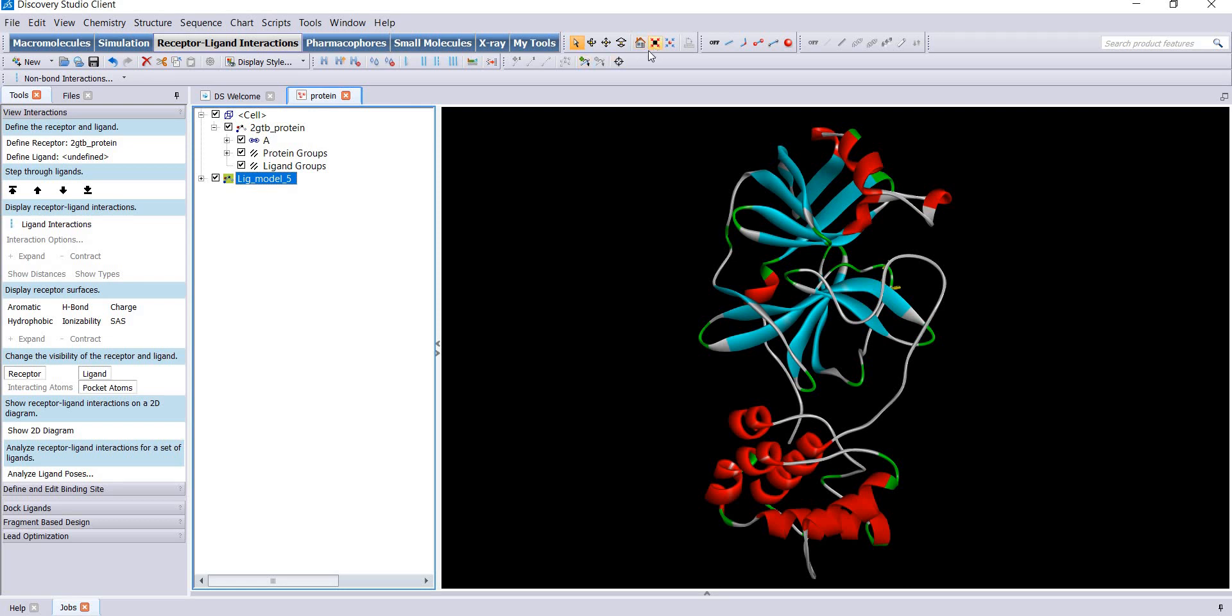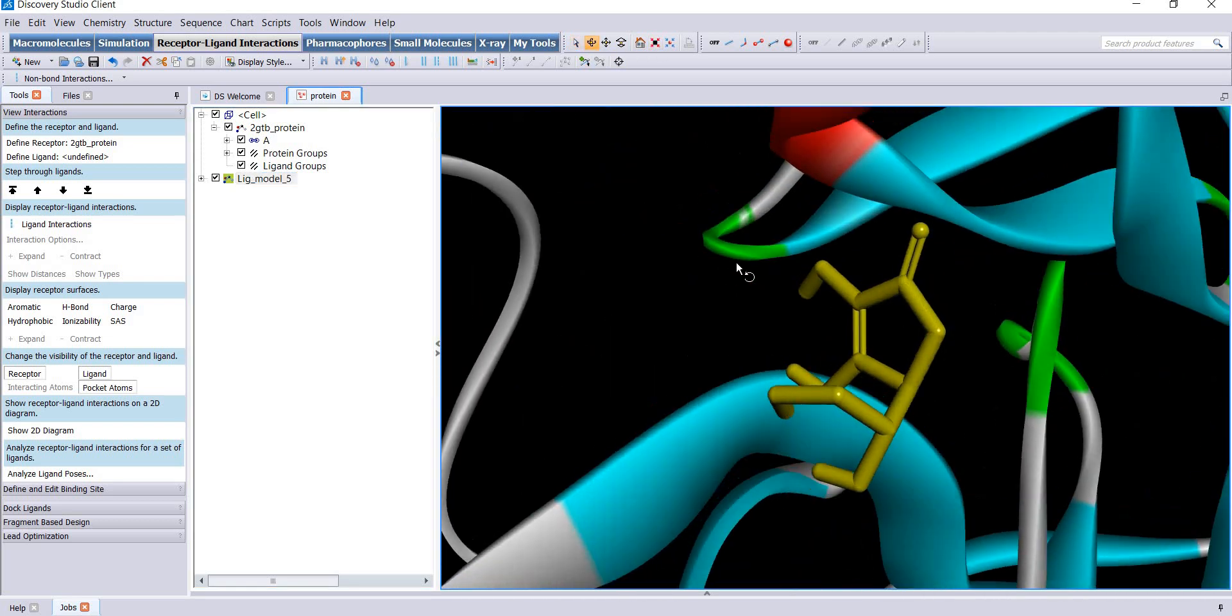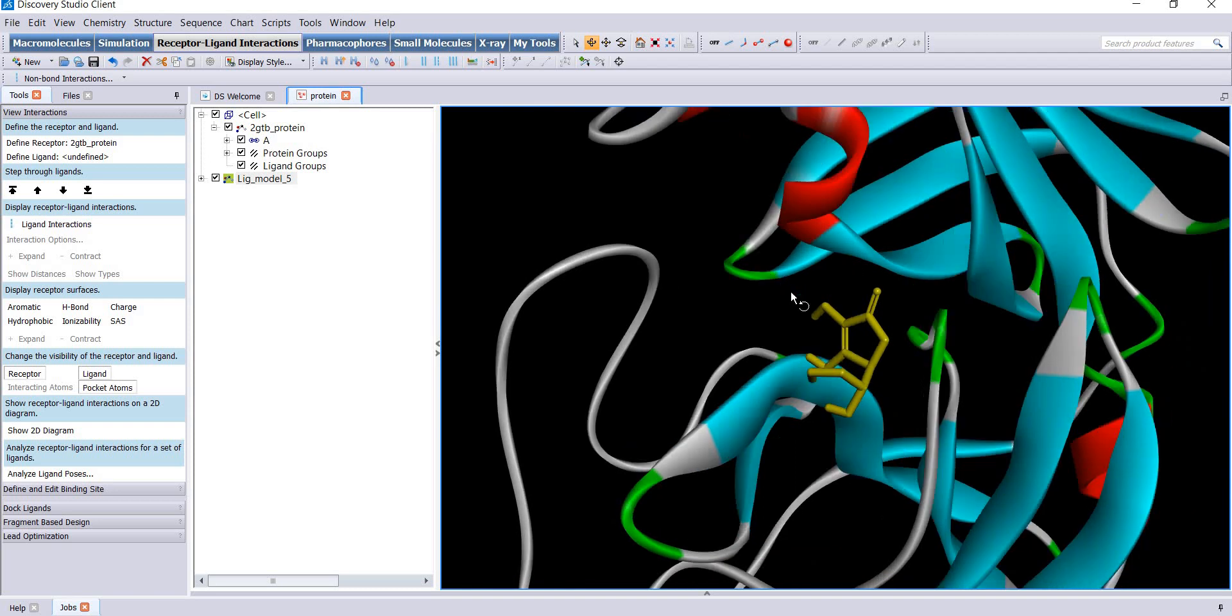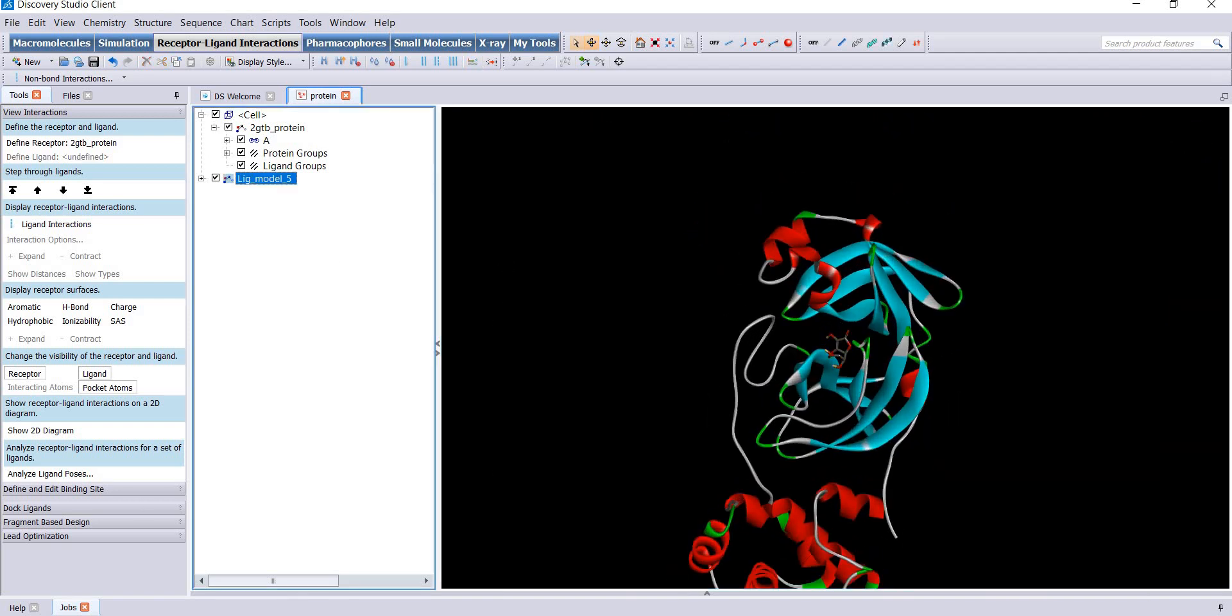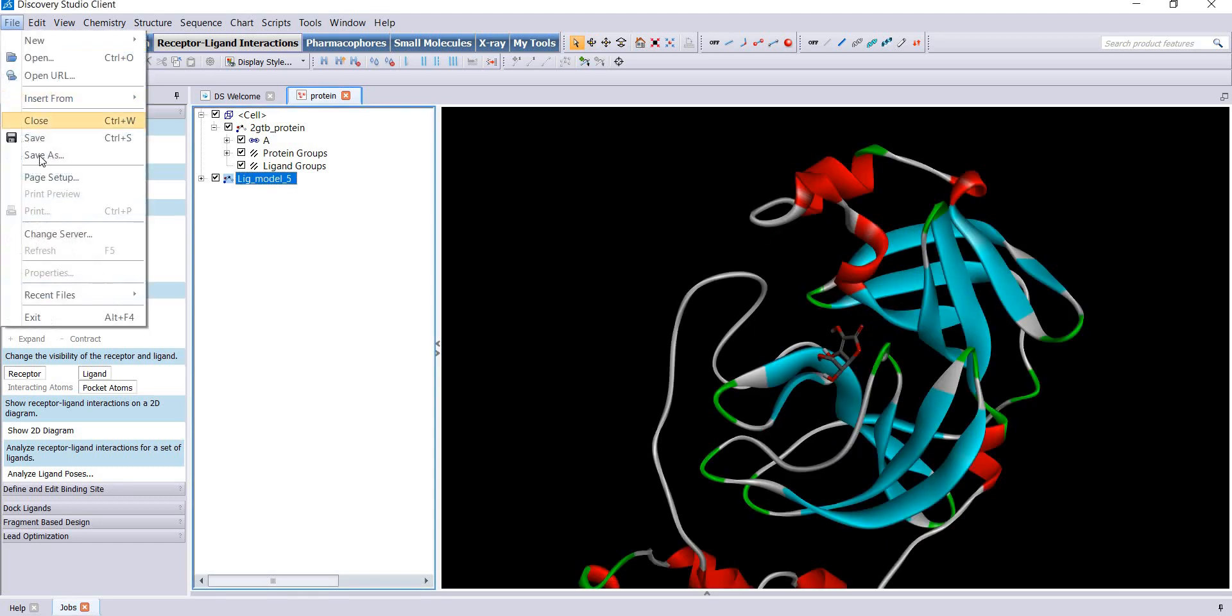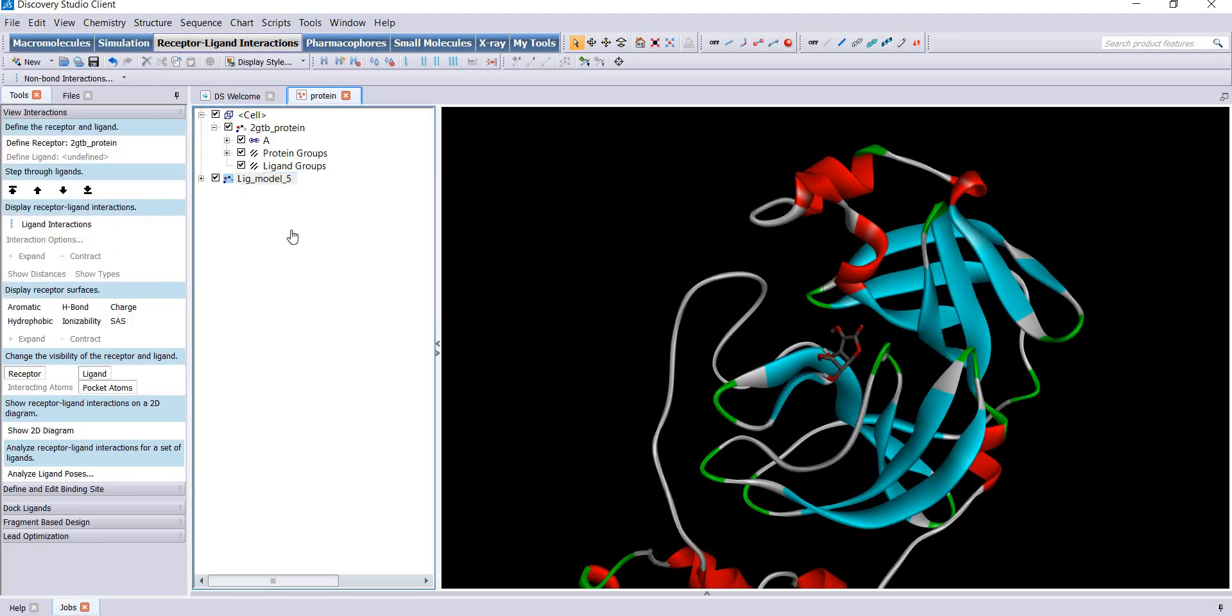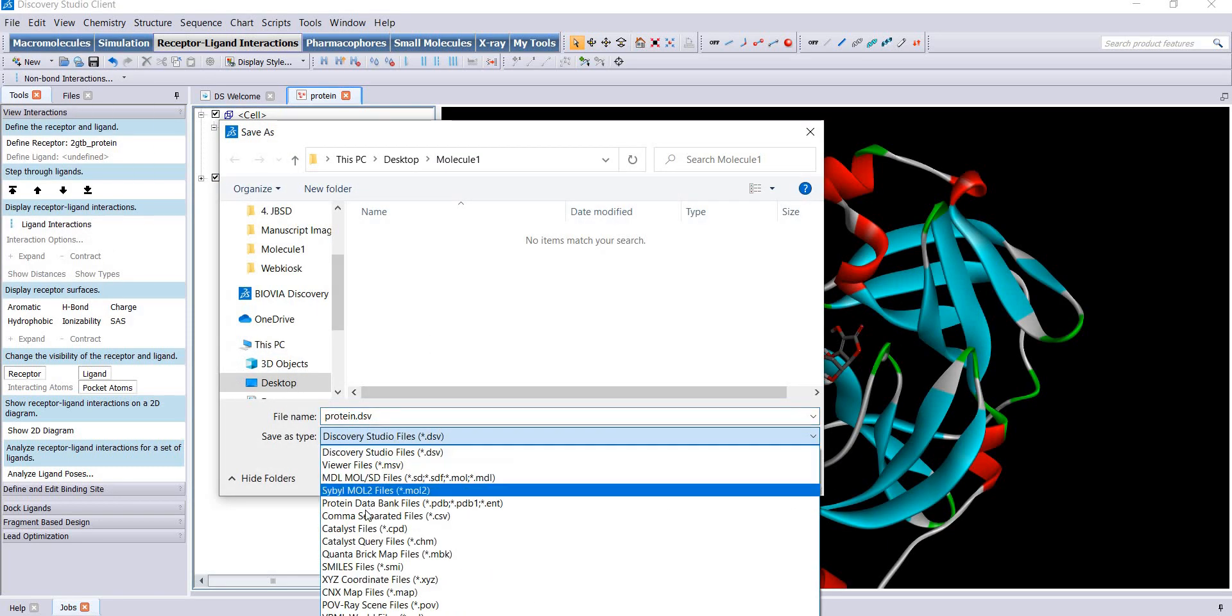I want to save this complex as protein databank files PDB. I have already saved it, so save it as complex.pdb.